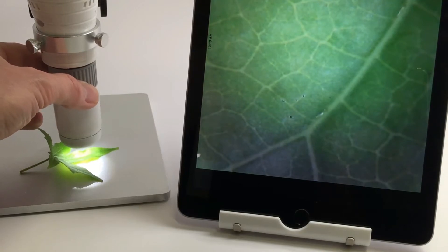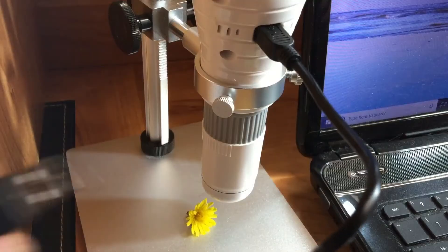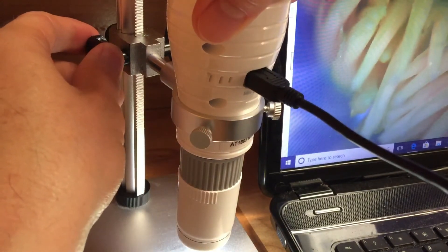For using with your PC, simply download and install the included software, then connect the USB cable to your microscope and then to your computer's USB port. Make sure your selector switch is set to the off position. Open the software and then view your subject, take photos and record video.